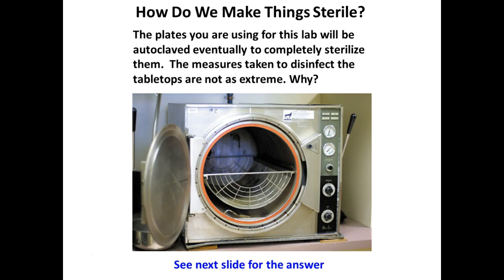We share our sink with the biology lab, 107E if you were in there. Those weird looking machines in the back of the room, those are our autoclave machines. So if you're curious as to what they look like, walk by 107, you'll see them in the back of the room. Miss Paula tries to run that when there aren't classes, because it's warm, it's smelly, it's yucky. As she said, she loves killing all our bacteria.